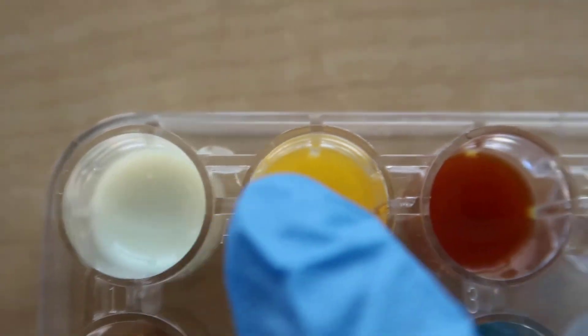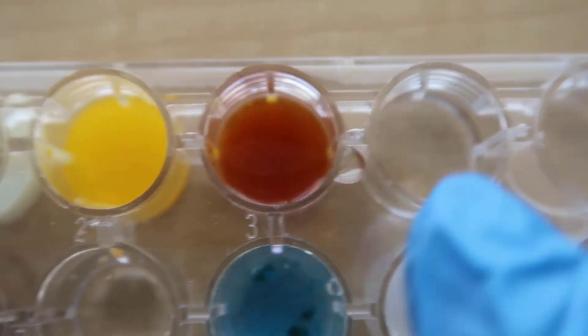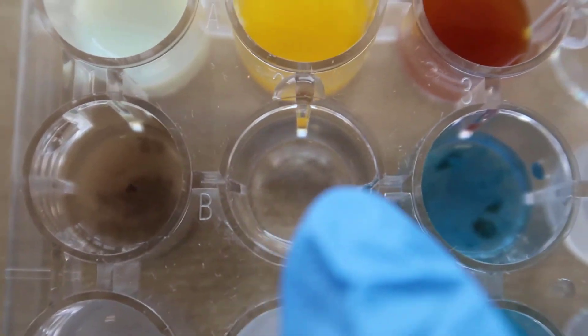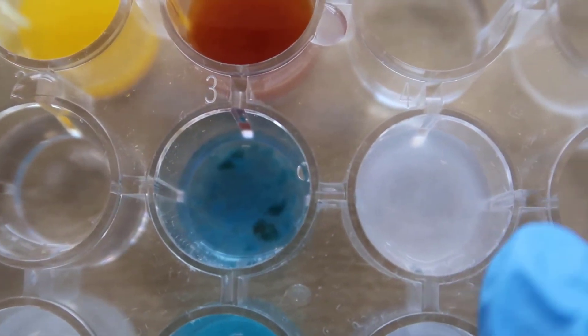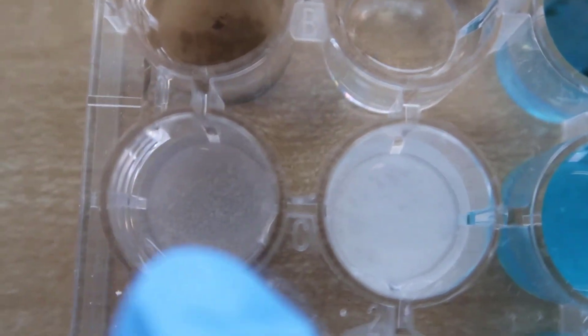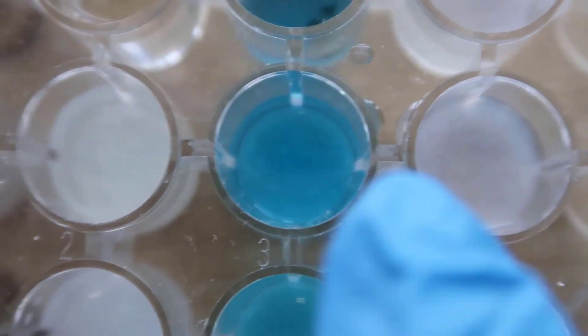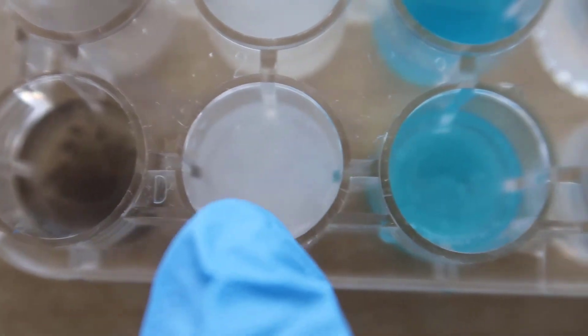So this was the KI. This is the NaOH. You can see this a little bit better. This was the Na2CO3. And then this was the Na3PO4 row.